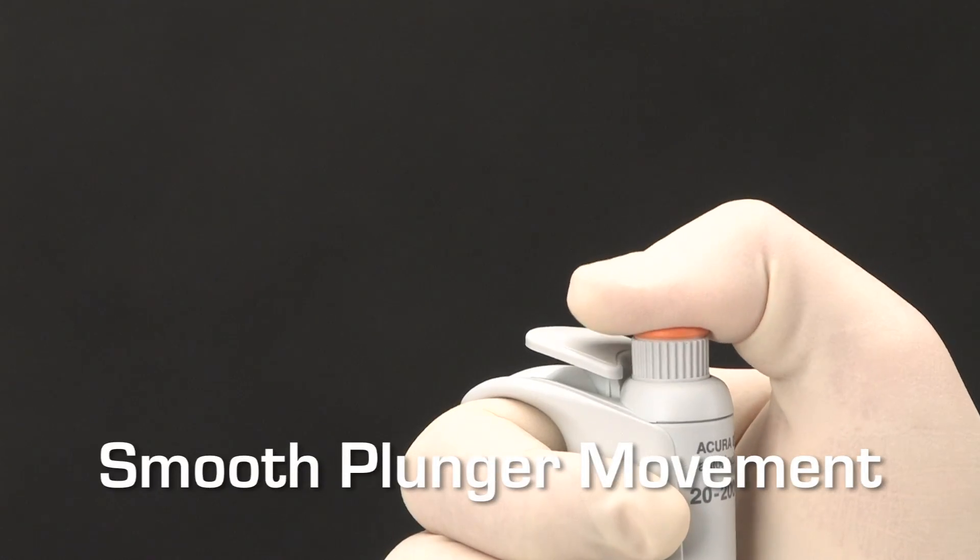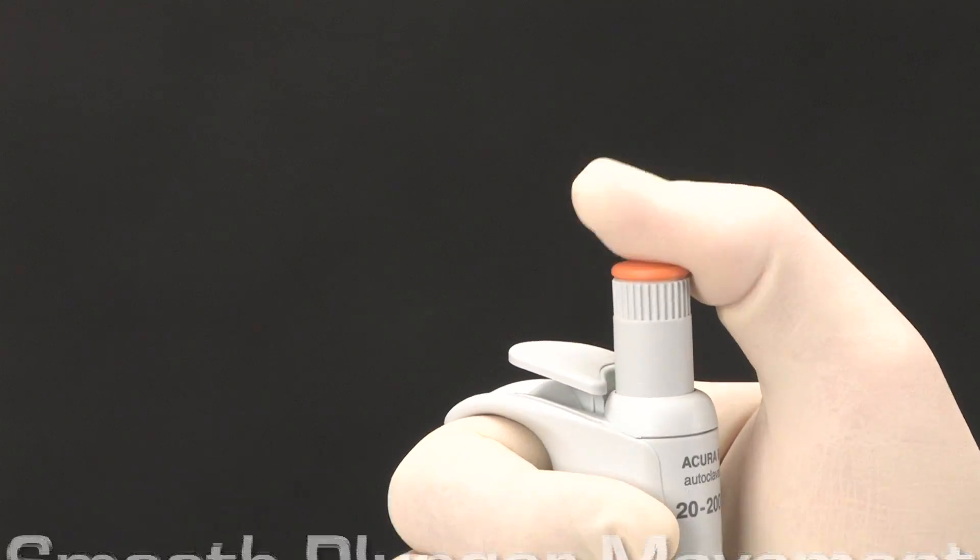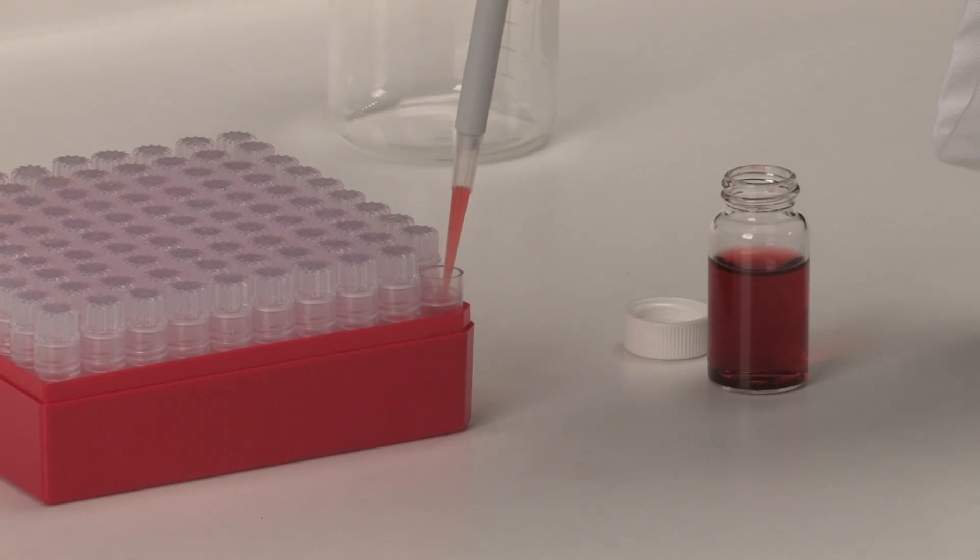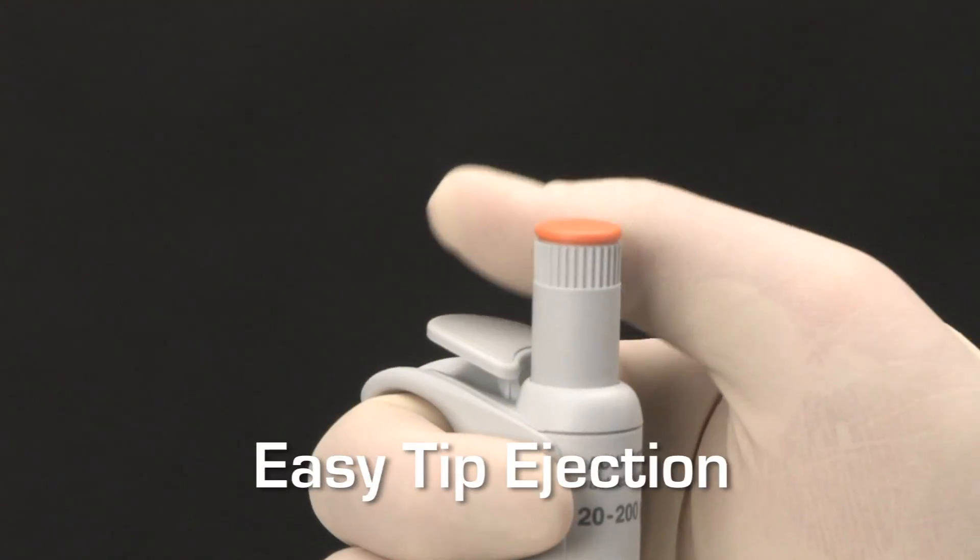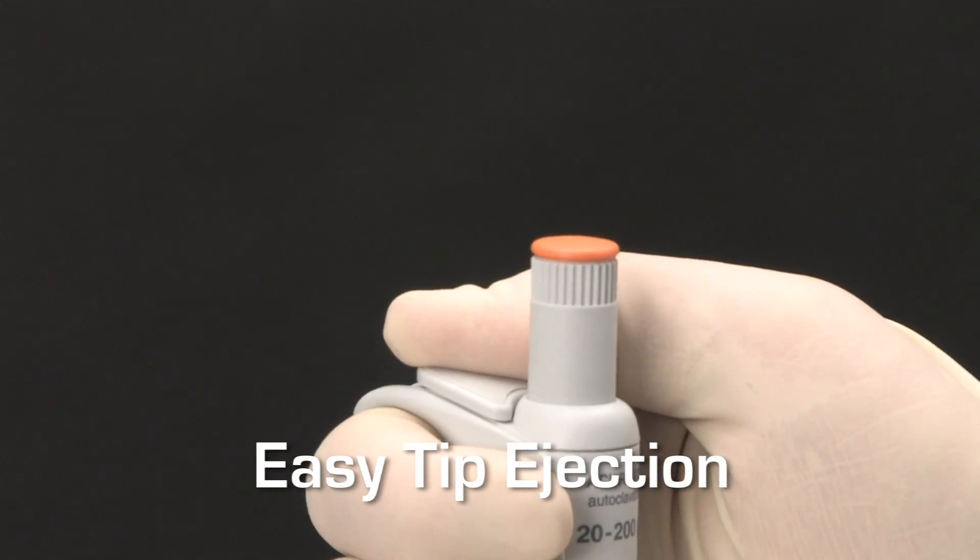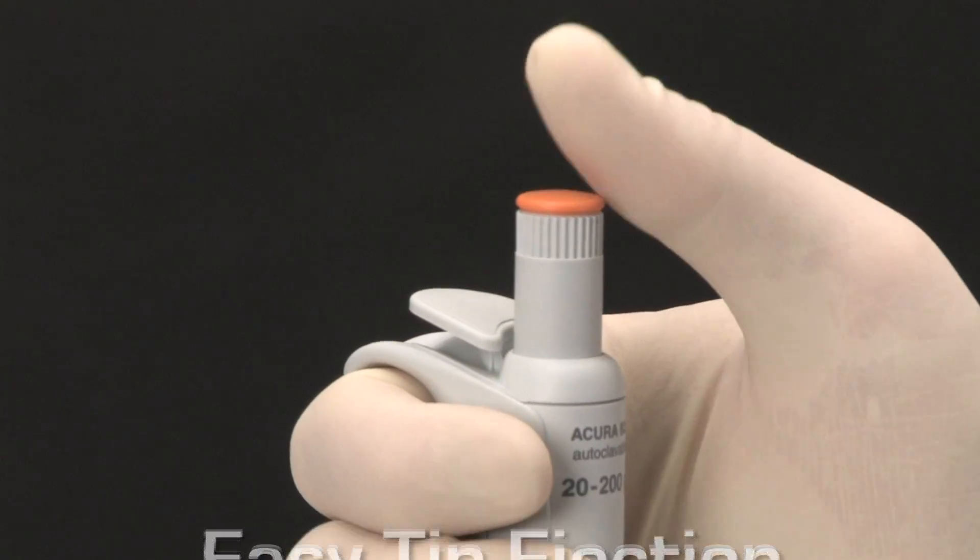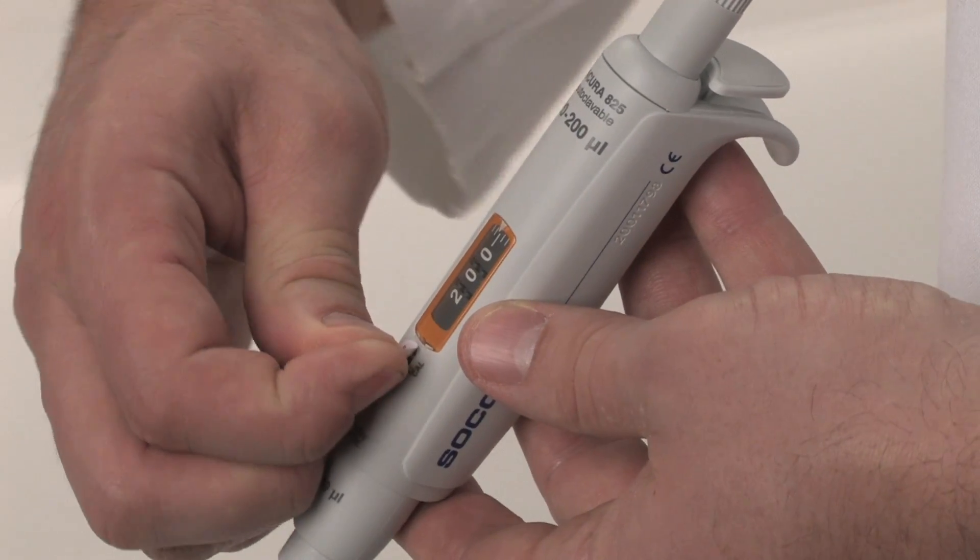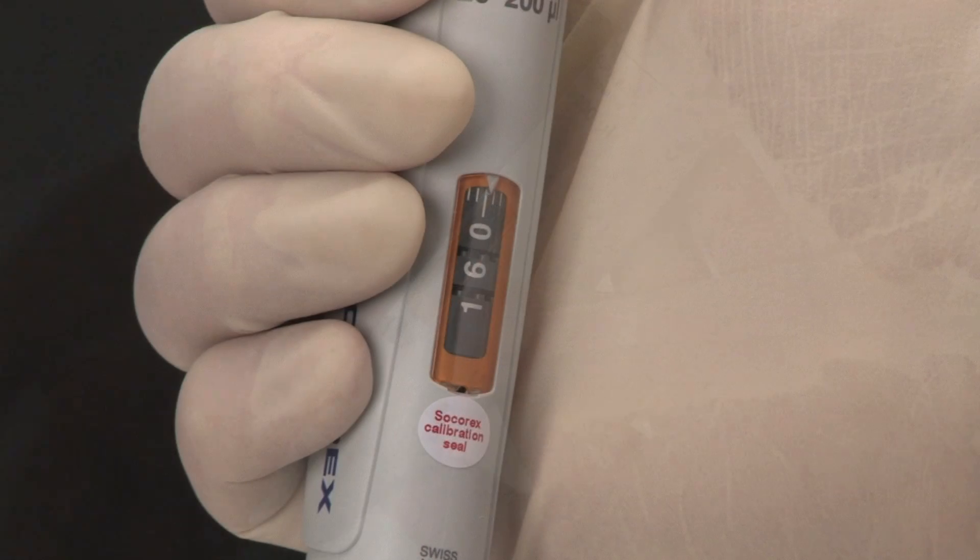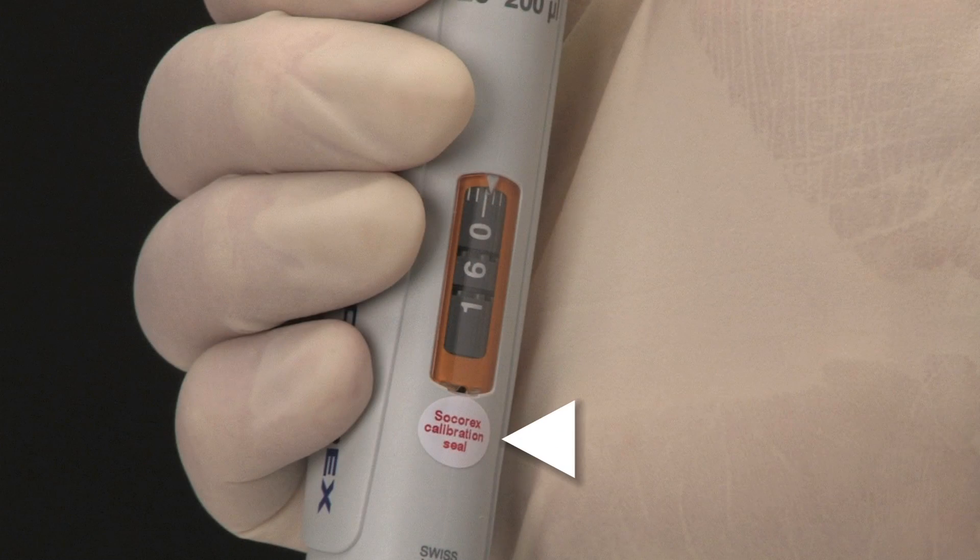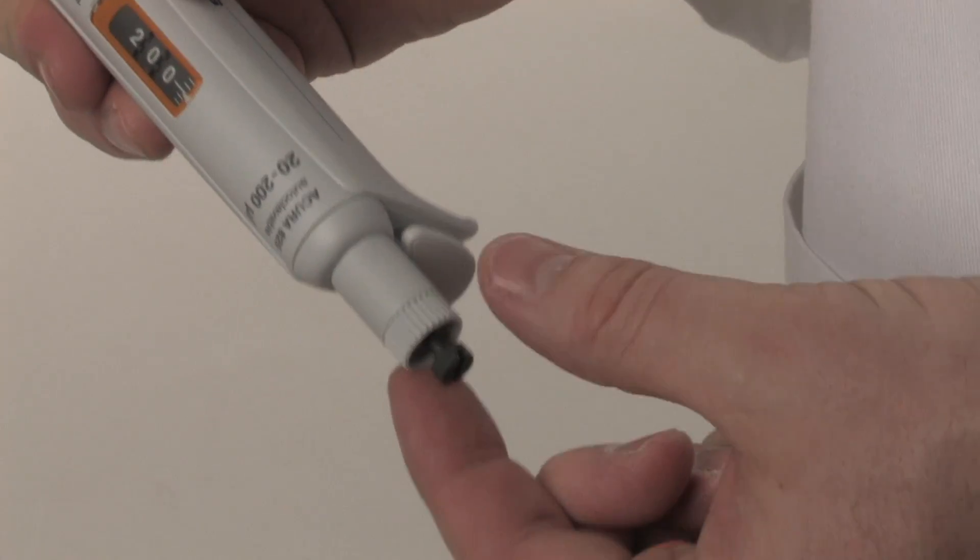The smooth plunger movement enables aspiration and dispensing operations to be performed with minimal effort. Once dispensing is complete, the tip can be easily ejected by pressing the large, soft-padded button. The calibration system enables user-friendly, in-lab calibration. The locking mechanism is protected by a calibration seal sticker. The system also features an integrated key.